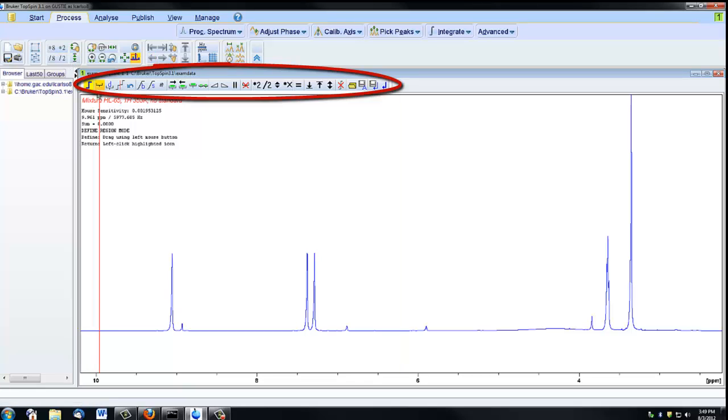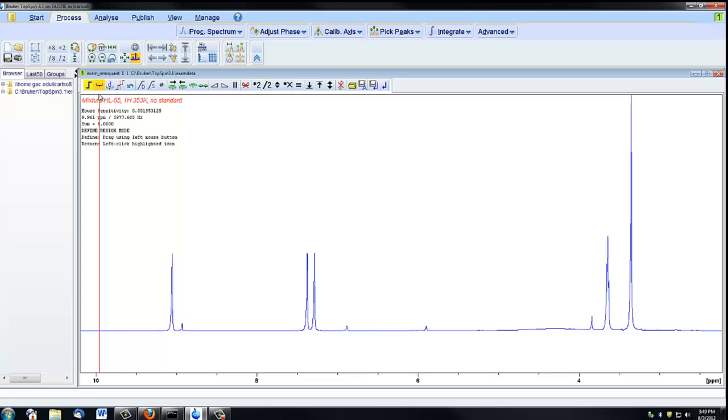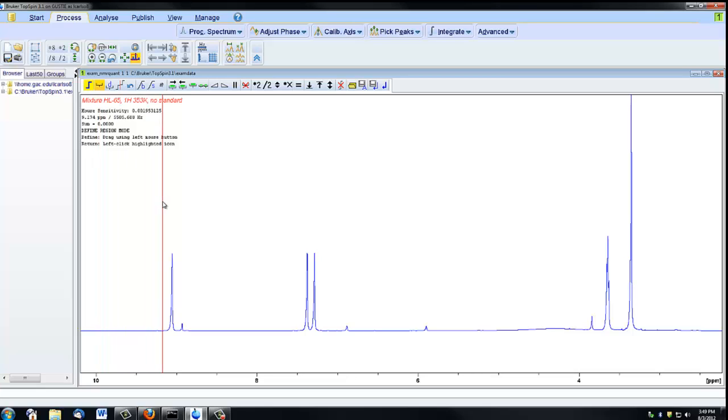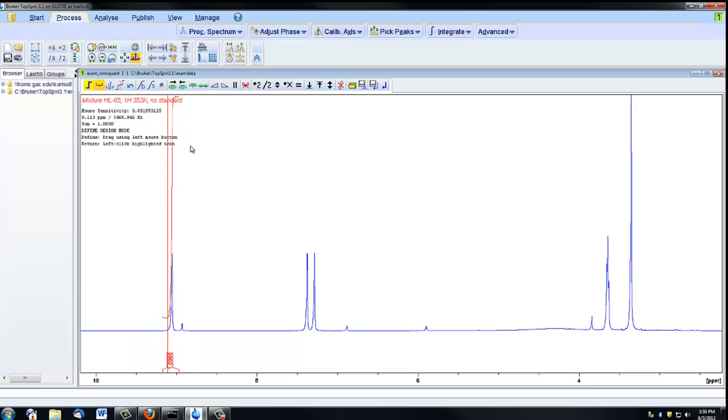When this first icon here is orange, that means it's selected, and you can click and drag, and everything between the red lines will be integrated.